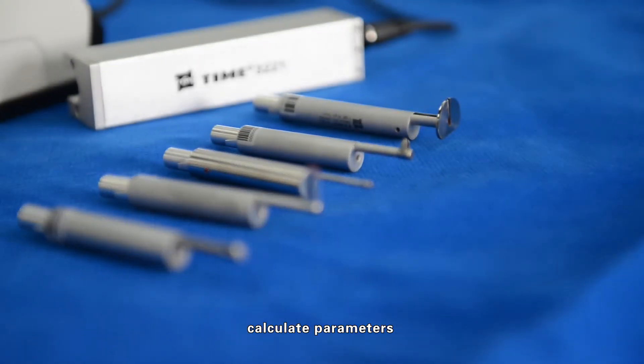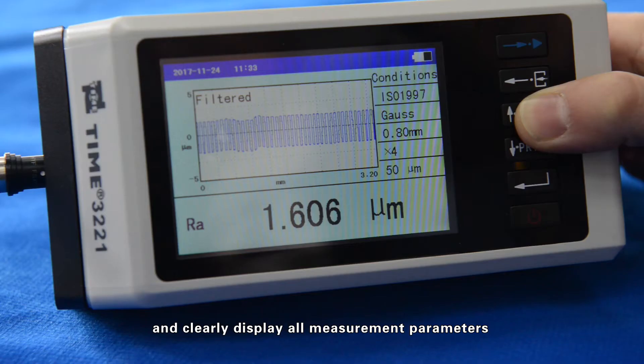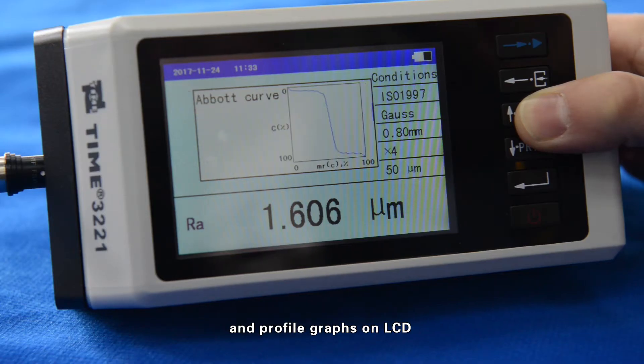It calculates parameters according to selected measuring conditions and clearly displays all measurement parameters and profile graphs on the LCD.